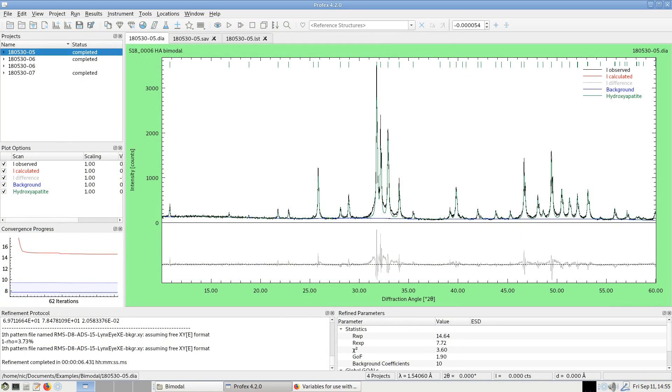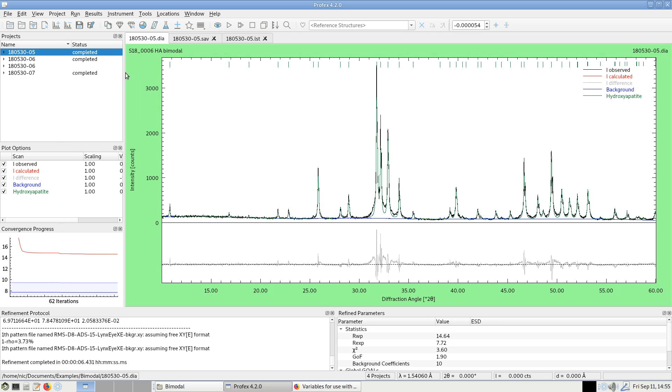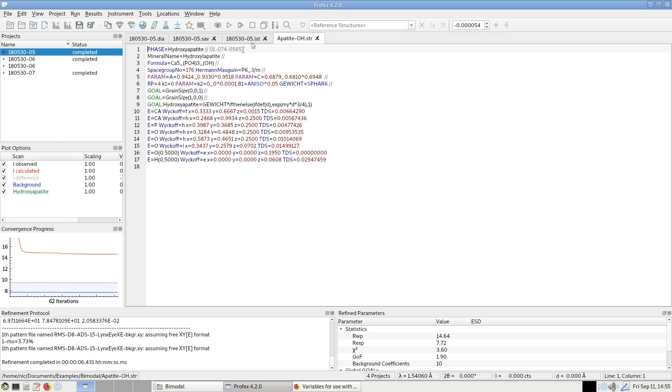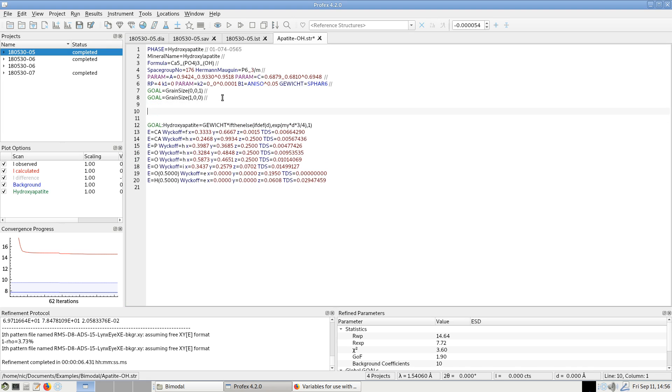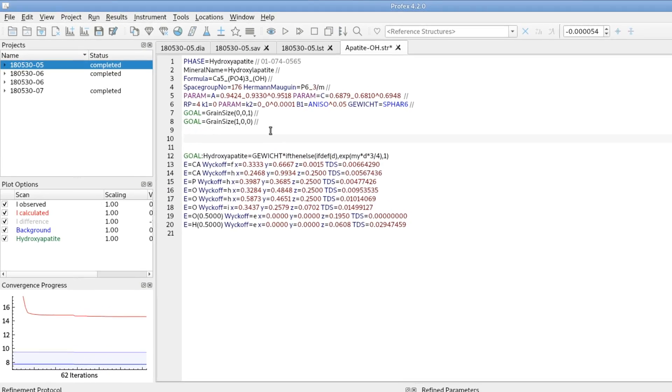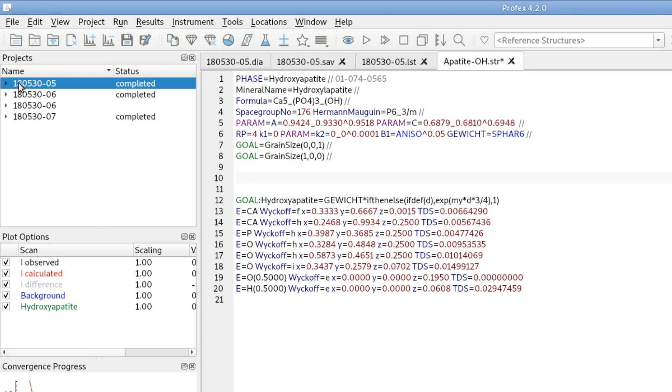But since bimodal crystallite size distribution is a phenomenon that might occur from time to time, Profex has a predefined text block to activate sub-phases and to refine two independent size fractions. We have to open the structure file we want to activate sub-phases. In this case we only have hydroxyapatite.